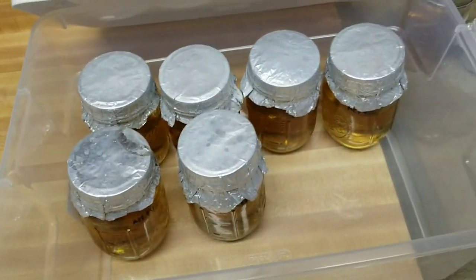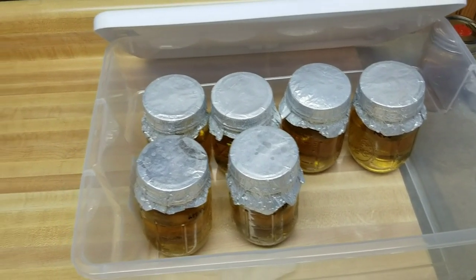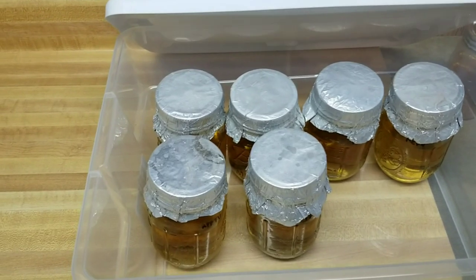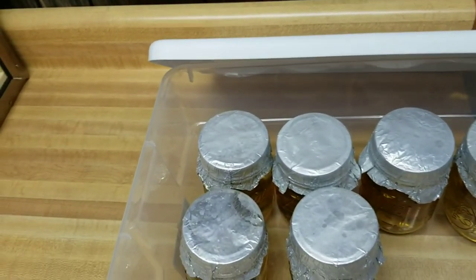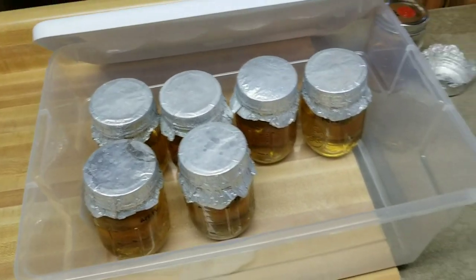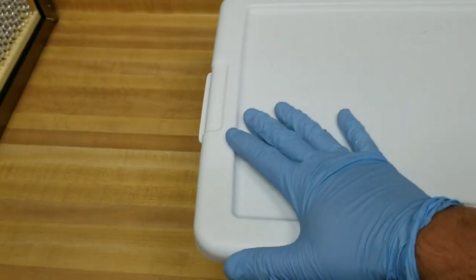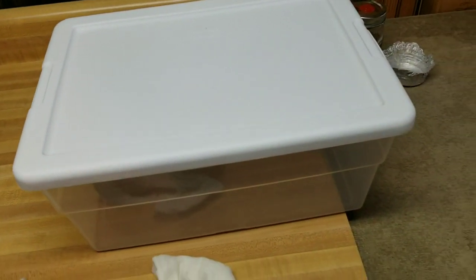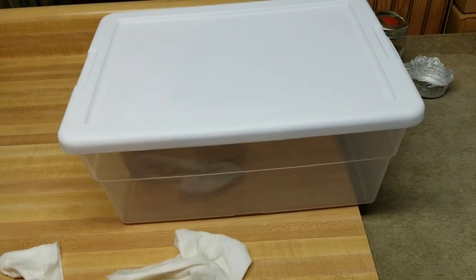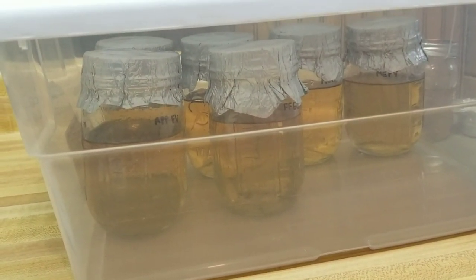We have them all in our storage tote — I'm going to cover that up. You don't want them in any direct light. Mycelium does not need complete darkness to grow — that's a myth — you just don't want really direct bright light or sunlight. I'm going to lay a towel over the top to keep them shaded, and in two to three weeks we should have nice viable jars. If you have any questions just hit me up in the comments.